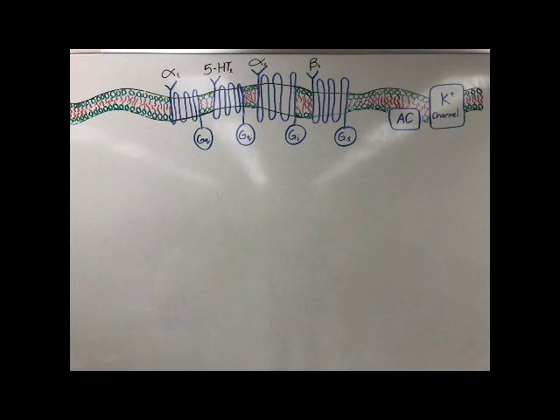The duration of the contraction caused by ergotamine's administration is incredibly variable due to the fact that ergotamine is binding to many different receptors, and as such the effect is not predictable in any form or fashion and is solely dependent on the tissue that is being experimented upon.